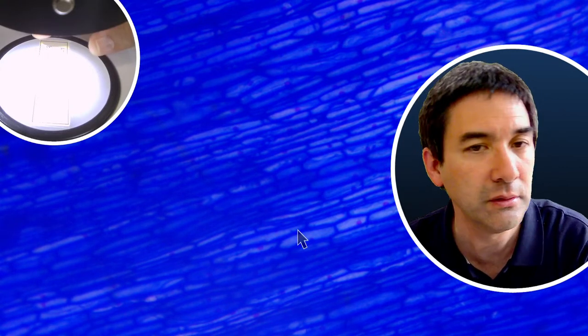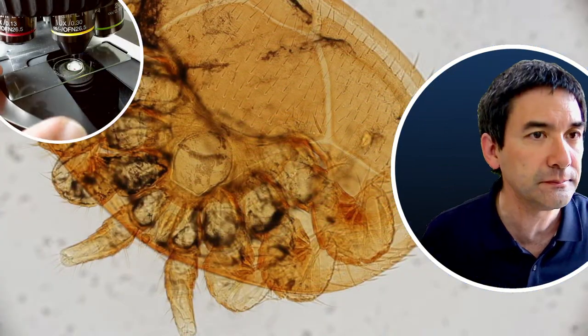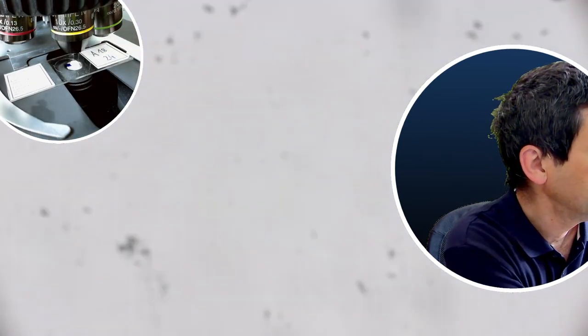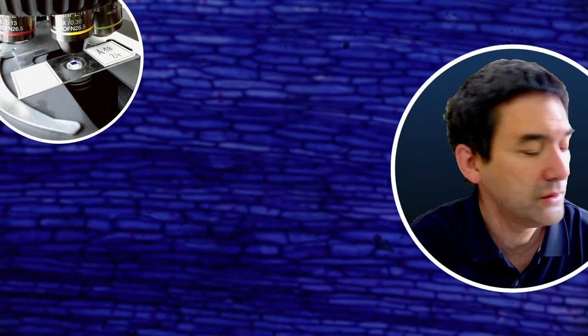Let's have a look now under the compound microscope. I have to refocus. It looks a little bit more bright and fairly similar. That's basically the comparison now under the compound microscope — much more light coming in from the bottom because the light is all concentrated to one point. I have to tell you I'm pretty happy with the stereo microscope. I really did not expect the quality to be that usable still for microscope slides.